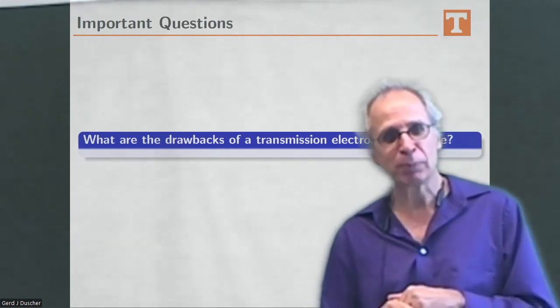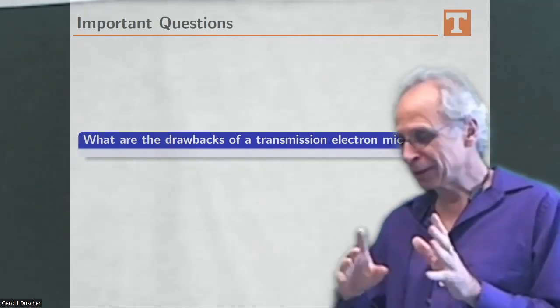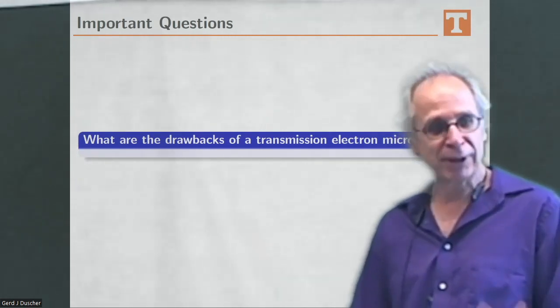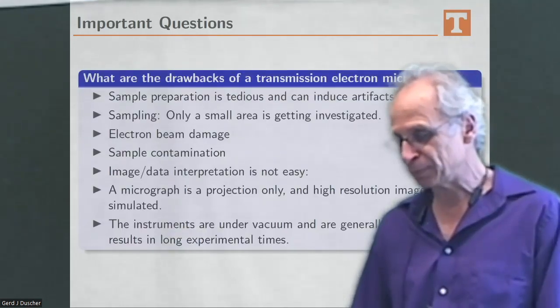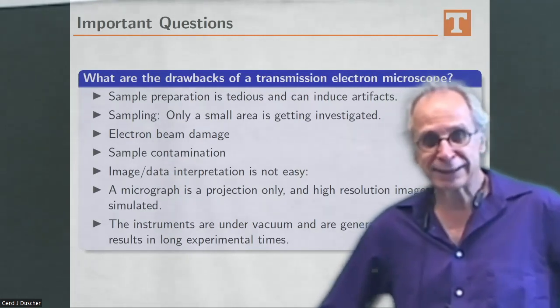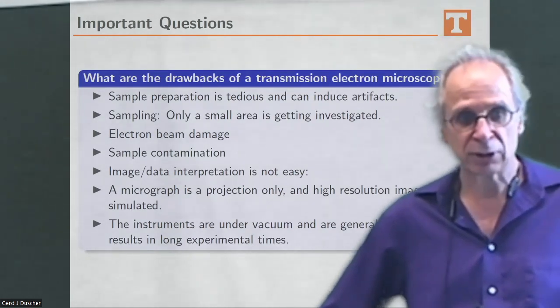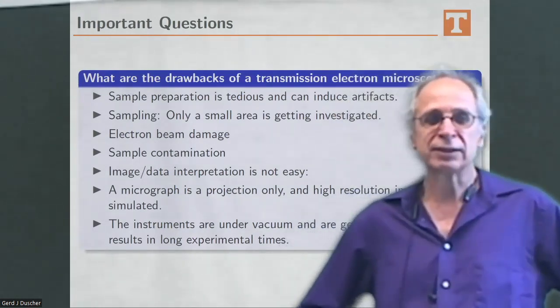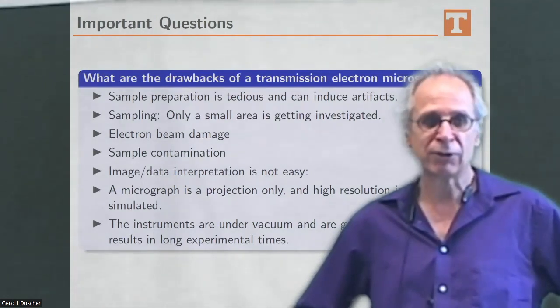I'm always forgetting the scanning probe microscopes, and I'm not sure why Sergey didn't yet kill my picture here, my transmission here. But anyway, SPM is a different animal, and of course you can also get atomic resolution here. Scanning probe. What are the drawbacks? One drawback is certainly that you need very thin specimens, and that is an art by itself. Usually it needs to be self-taught.